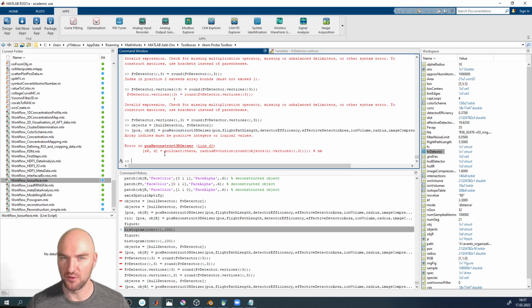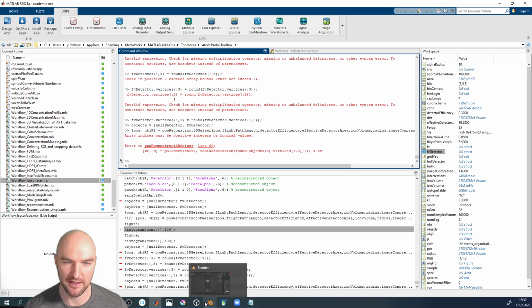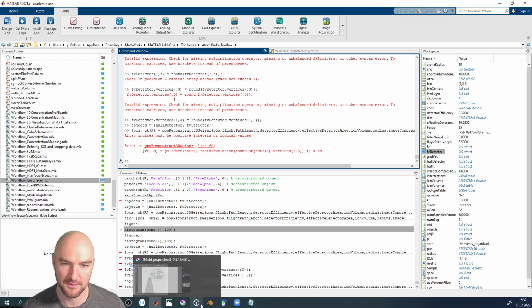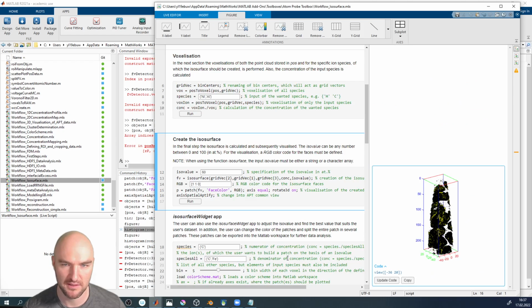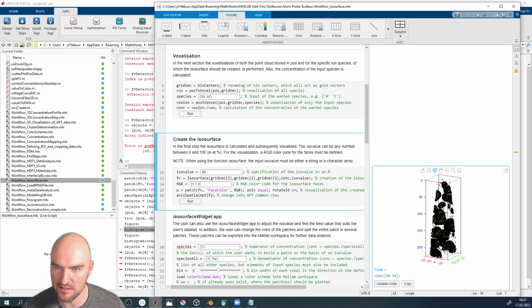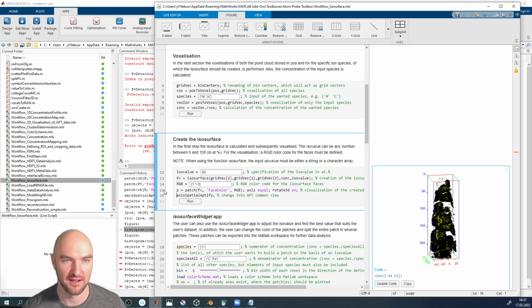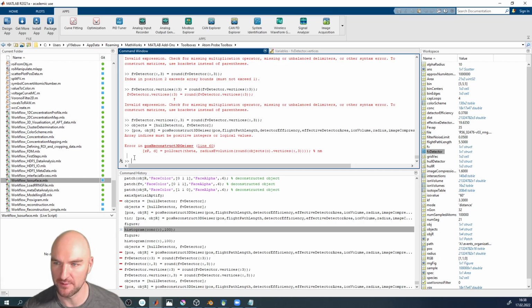Okay. So with 5 minutes left, I'm not going to chase the error there. But one thing that we can obviously do is split the objects. Sorry, where's the isosurface? One thing we can do is just split the isosurface and take, for example, that one precipitate that doesn't hit the surface. Okay, do we have enough time for that? I don't think we will have enough time for that.